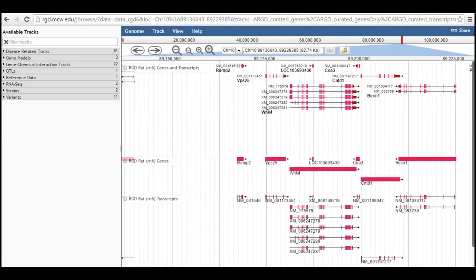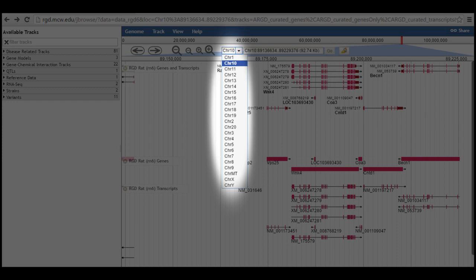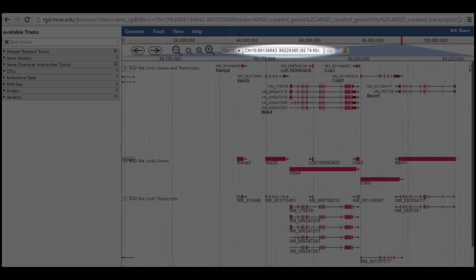The next item of the navigation panel is a drop-down list of chromosome numbers which can be used to change the display to a different chromosome. Alternatively, you can use the text box beside it. This box, which by default shows the exact nucleotide position being displayed below it, can also be used as a search box.